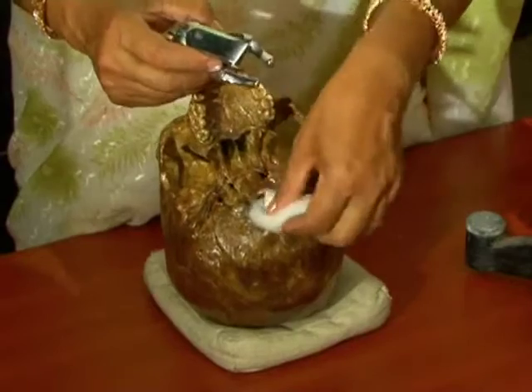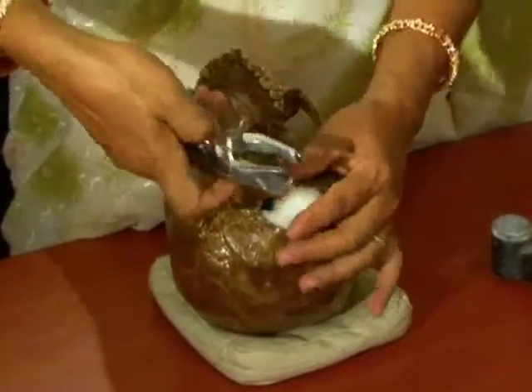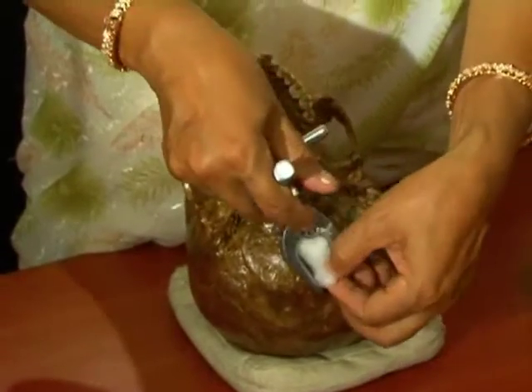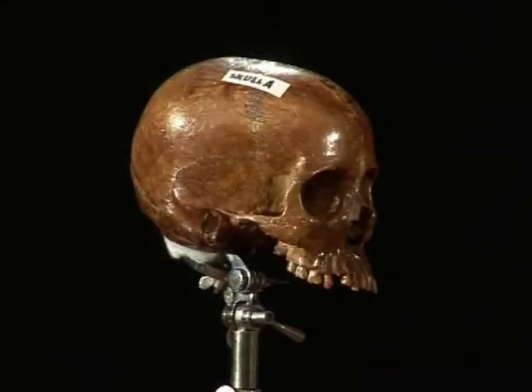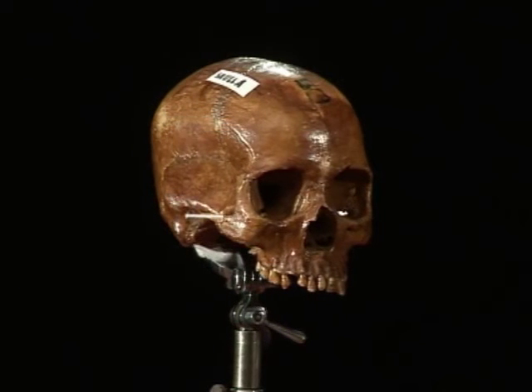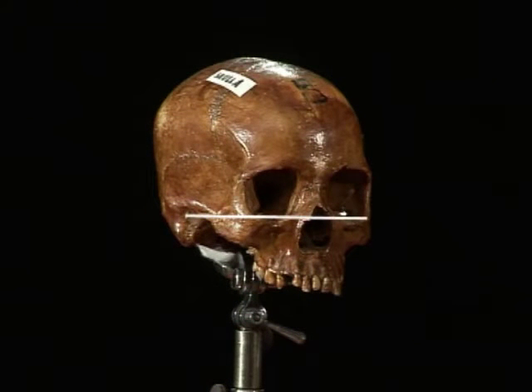Now coming to precaution. To avoid any damage to the skull while fitting or mounting it to the skull holder, cotton pads are used as a precautionary measure. The skull should be properly oriented on the fixed FH plane, lest the variation of the plane will lead to inaccurate reading.